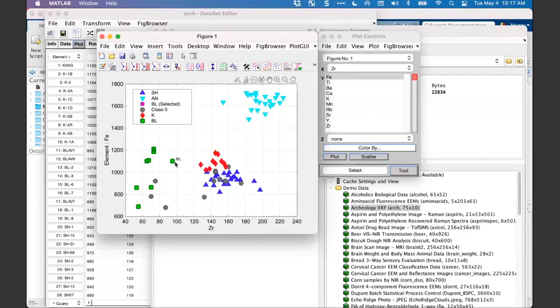Because we just selected the class. You won't see the change here until you click again on the class. If you had another plot associated with this plot, then you would see that. But if you just have one plot, you just have to click on it because it toggles through it. So you can see now that that is the class that is selected. I showed you before how to display labels for the samples in the graph.